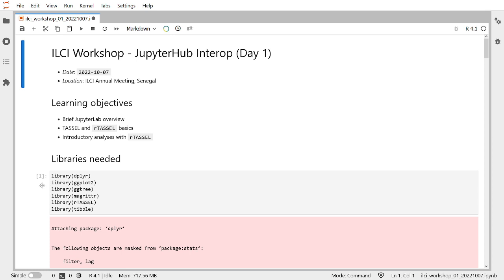And to do that, there are 3 different flavors. There's code, there's markdown, and there's also a raw form. But we've already had another workshop covering that, so I'm not going to go into a lot of details. And while I go through this notebook, I'll guide you through some of the different functions that may be of use to you.